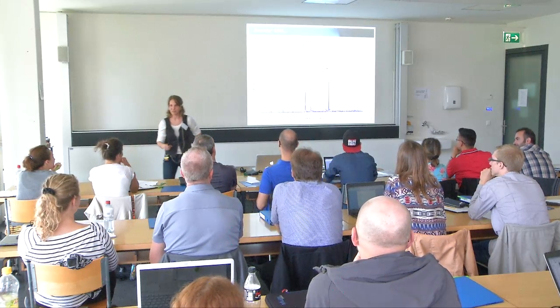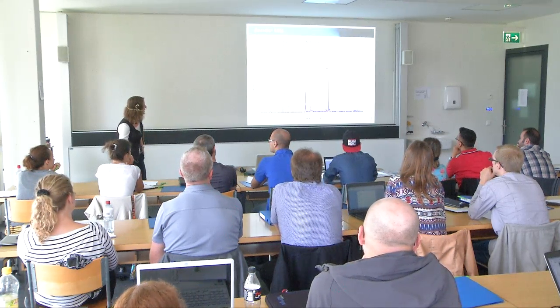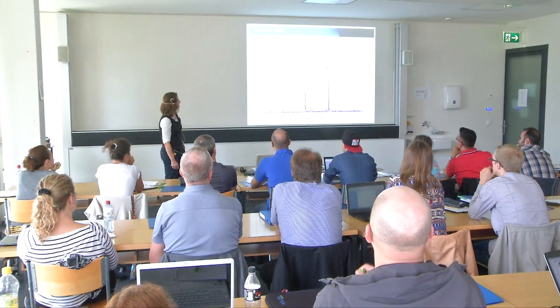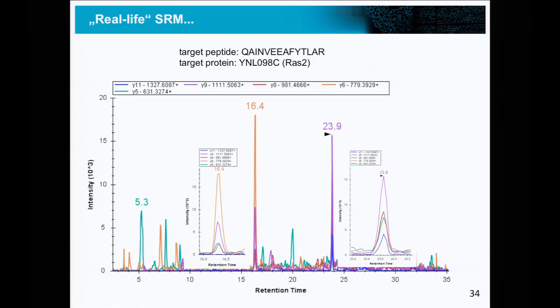Okay, why are you for 23 minutes? You think the peak shape is a bit better? Well, I would say they're very similar. But I mean, you're all right. There is no way to really be sure about it, right? You pick, and you will never know if you're really measuring the right thing.